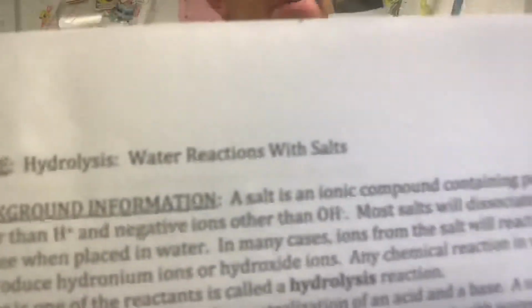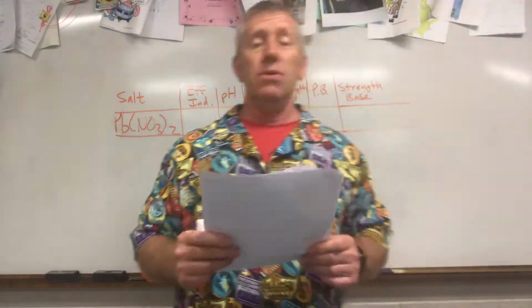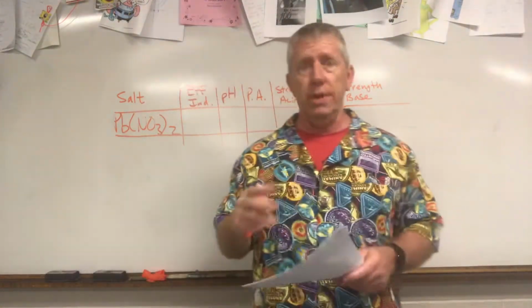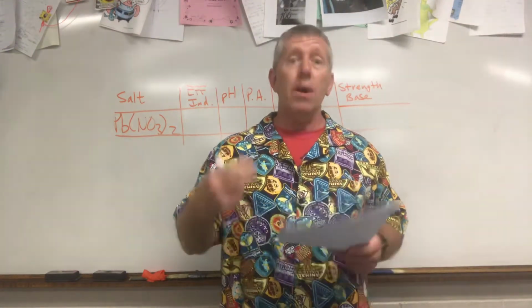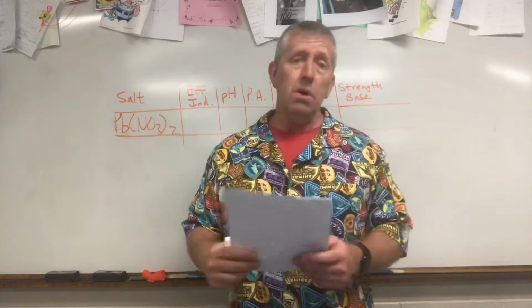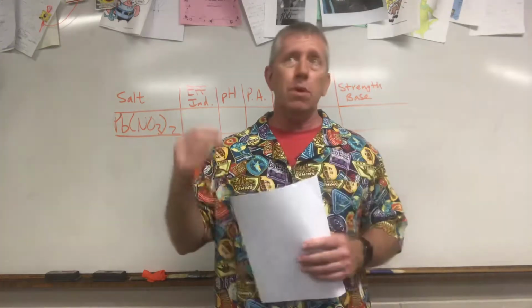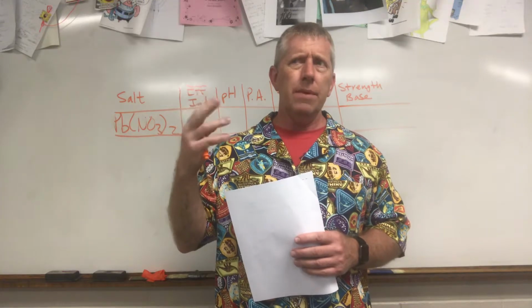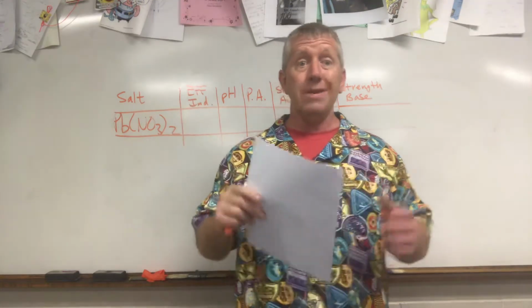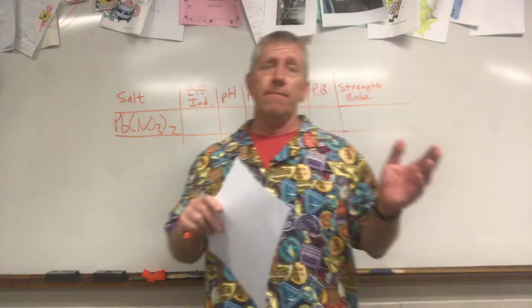Grab this. Lab today, hydrolysis. Water reactions with salts. Now, you're not going to be very good at this lab if you haven't watched the videos on hydrolysis and reactions of salts. If we had met today, it would have been, I believe, the third video in, or problem 3. It's about salts and why salt can change the pH of your solution.